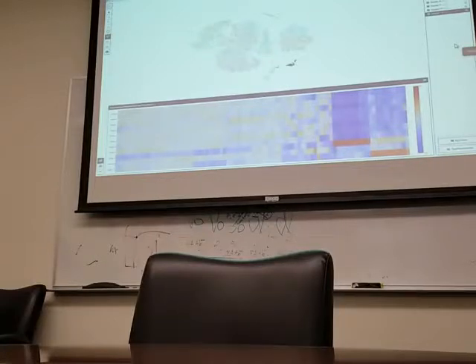Because a lot of this stuff you can also do in Seurat. It'd be interesting to see. We're either going to turn them off, or turn them off and reanalyze them, but we're not going to show them. We're not interested in them, and they're a contaminant. Everybody knows sorting is not 100%, so these things are going to go away one way or the other. Now that we know we don't want them, it'd be nice if they went away for the analysis too. You know what I mean?